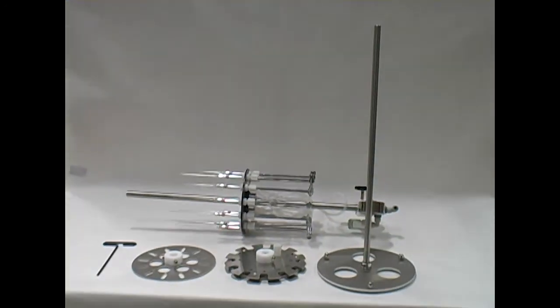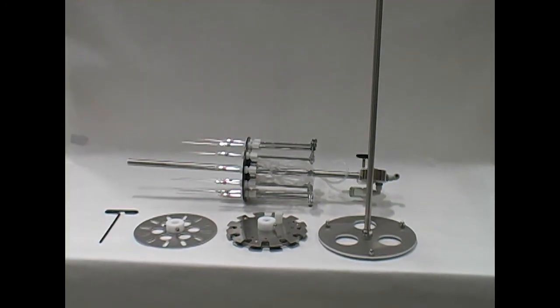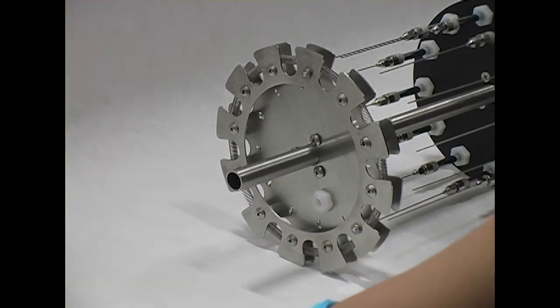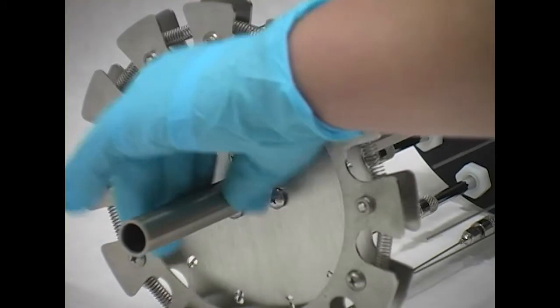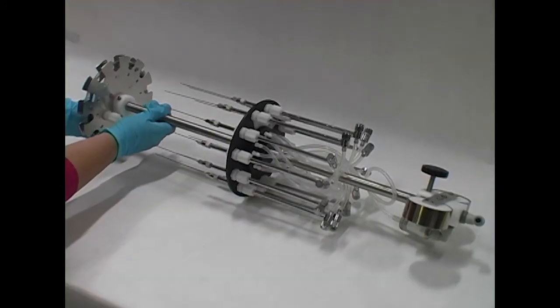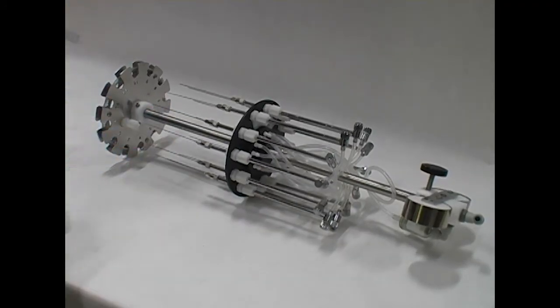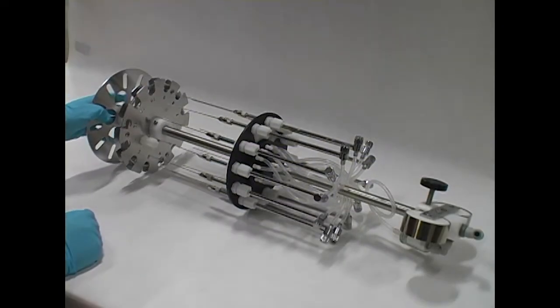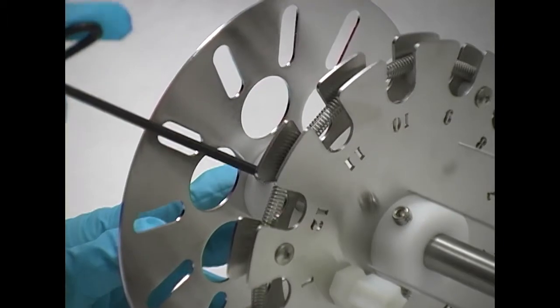If installing the optional sample holder for test tubes between 5 and 16 mm in outside diameter, loosen the set screws and slide the sample holder off the center rod. Place the sample holder about 3 inches from the bottom of the rod. Align the sample holder with the valve tubes to the center of the needles and secure in place with the set screws.